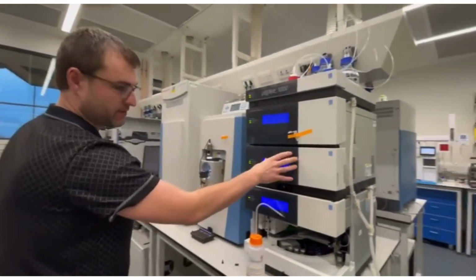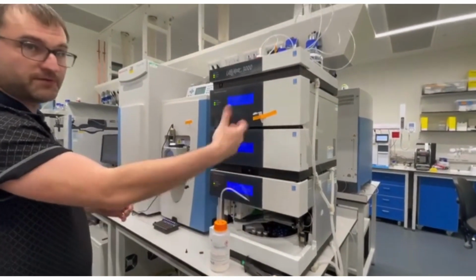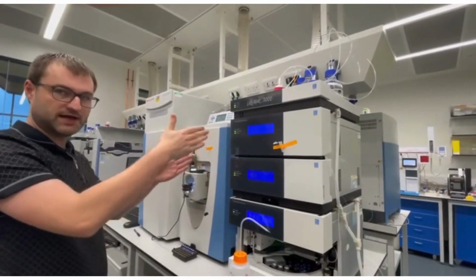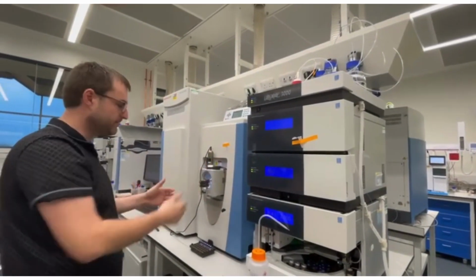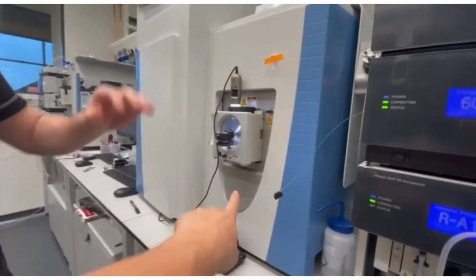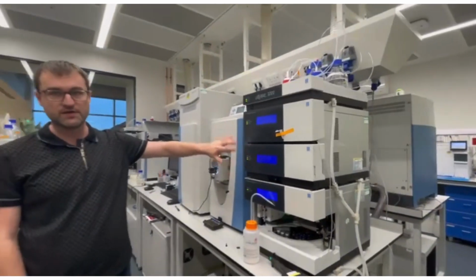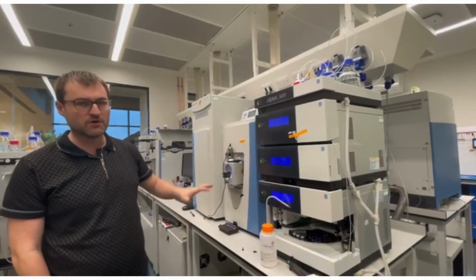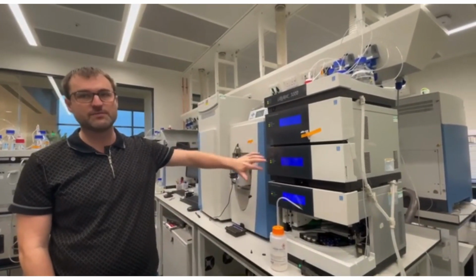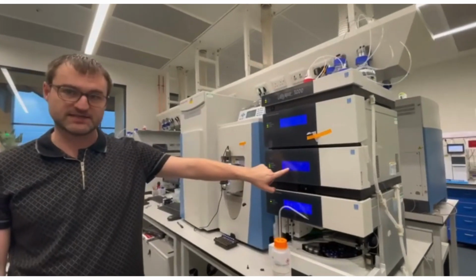So this is liquid chromatography. It will take our peptides as a mix, put them on the column and separate them, and then return them in small portions at a time to the mass spec, right? The column is inside the column compartment. The one thing you need for proteomics is very good reproducibility of your separations. The way to achieve that is to have the column at an extremely precise temperature. This is why you have this column compartment, and it says that it's at 60 degrees.